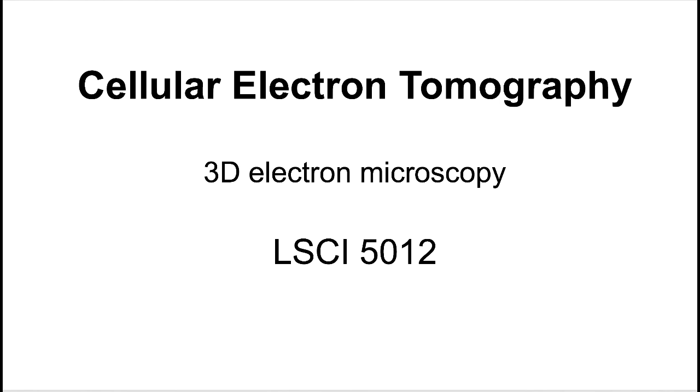Hello, this is the second video of LSCI 5012 for discussing electron tomography of cells. Electron tomography is a 3D electron microscopy technique to improve the resolution of transmission electron microscopy. In the previous lecture, I explained how samples for transmission electron microscopy are generated, and in this video I will talk about a method that increases the resolution of electron microscopy.